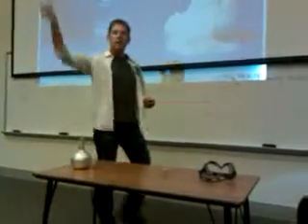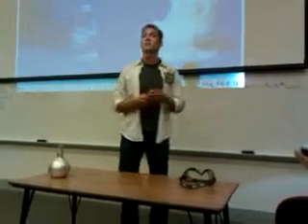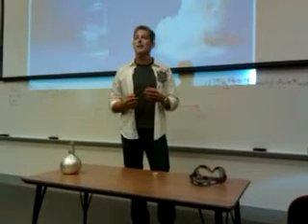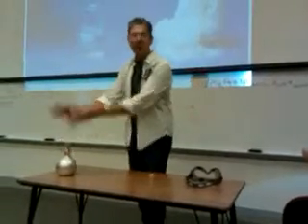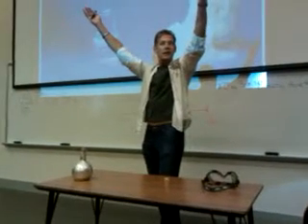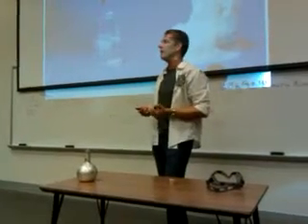What was this cloud then? It was water vapor. It's not going to be oxygen. Why? Can't see oxygen. But you can see condensing water. And so it was a gas phase in here, but then it hit the cool atmosphere, right? And it started recondensing into a cloud. And so that's what we saw. The genie was actually a cloud of water vapor. Why did it get hot?